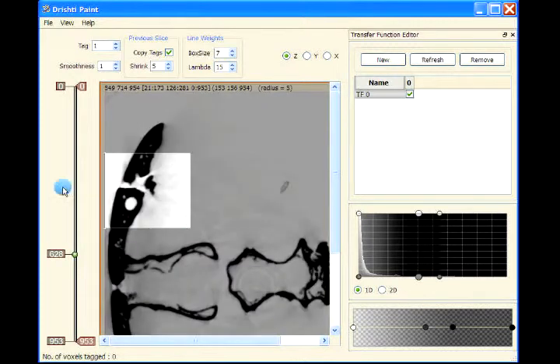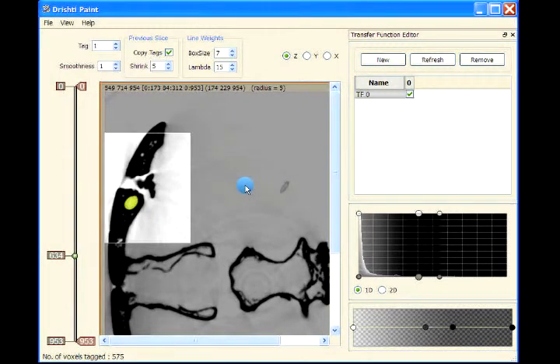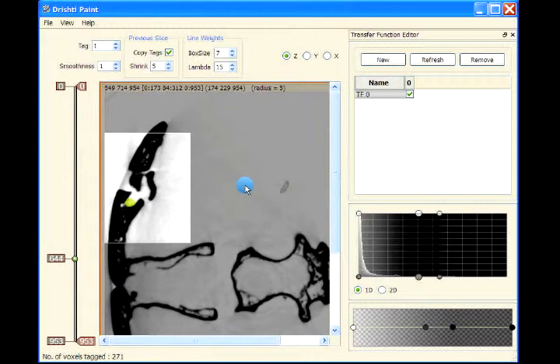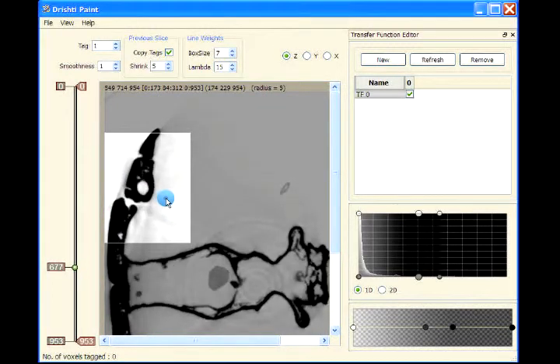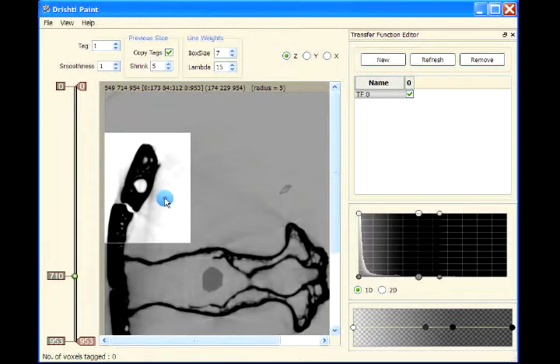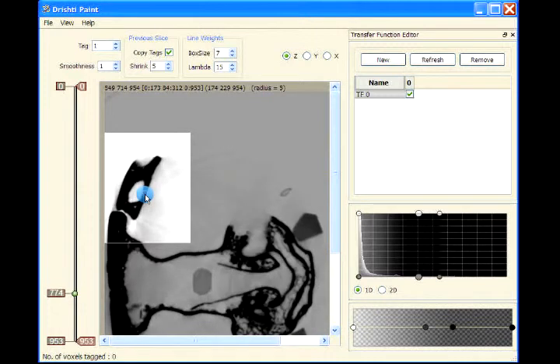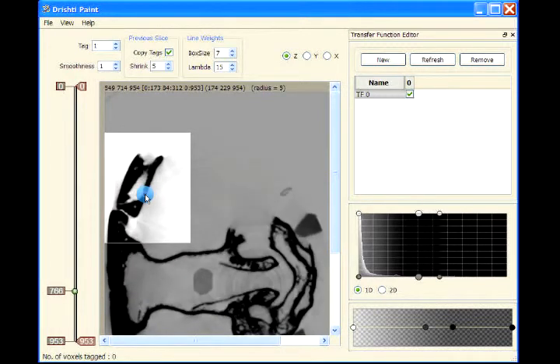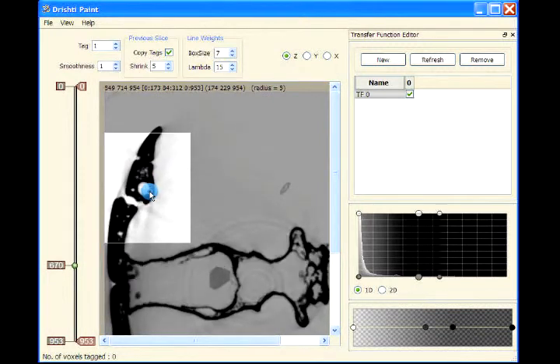So this side here, you can start the tagging process from here itself. So tag, and let's go forward and then afterwards we can just go backwards. Okay, and I think this channel probably goes on that side here. Yes, so this channel continues here.